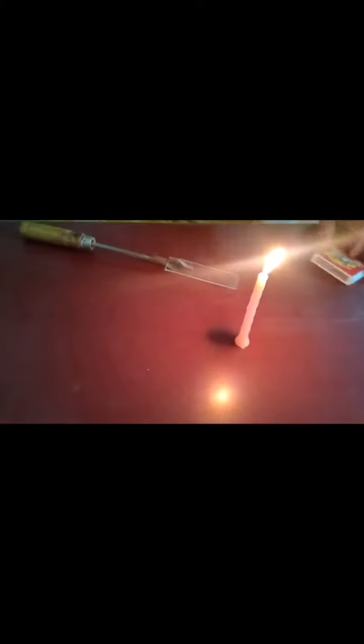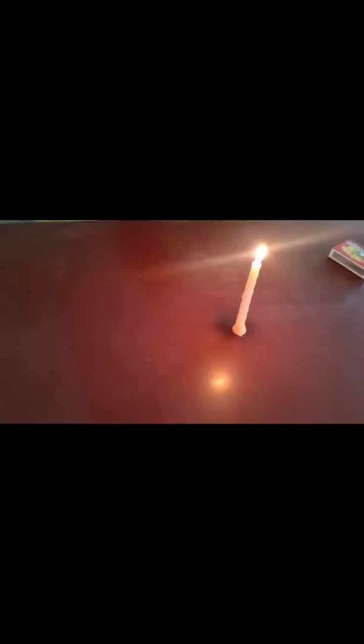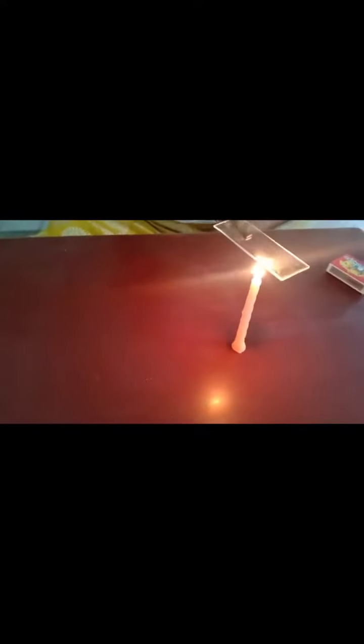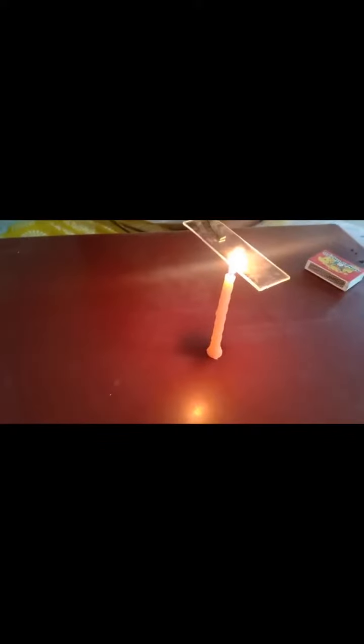Material required for this activity is glass slide, tongs, candle and matchstick. Now I light up the candle. Take a glass slide and put it in the candle flame for at least 10 seconds.